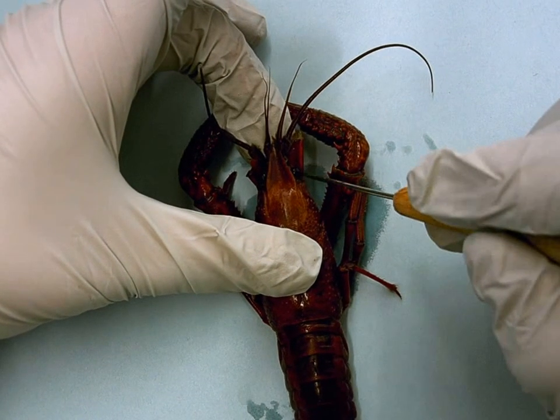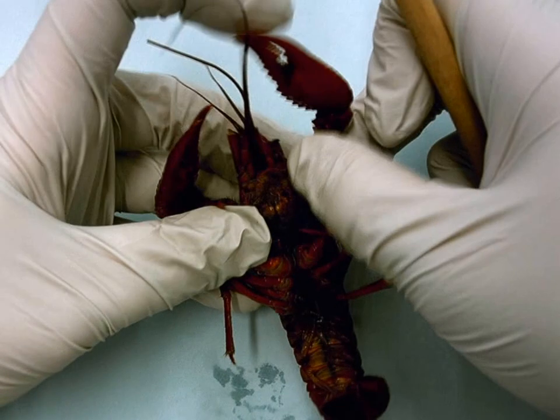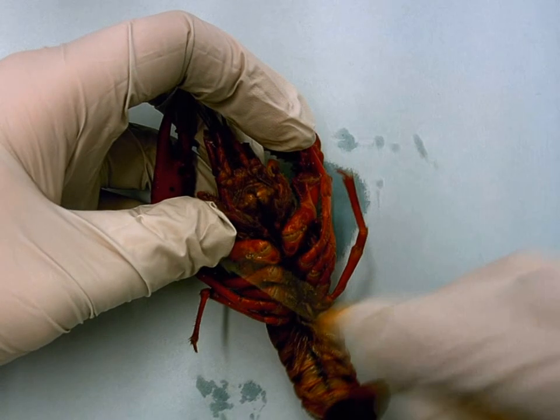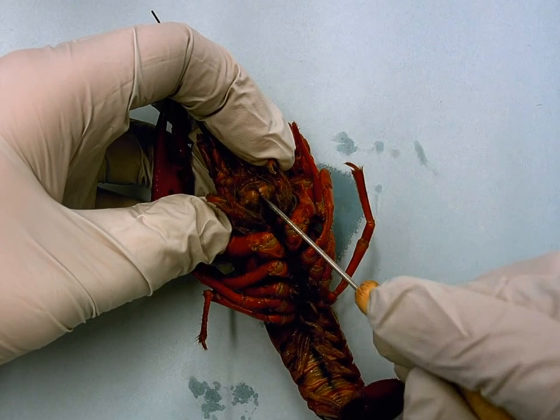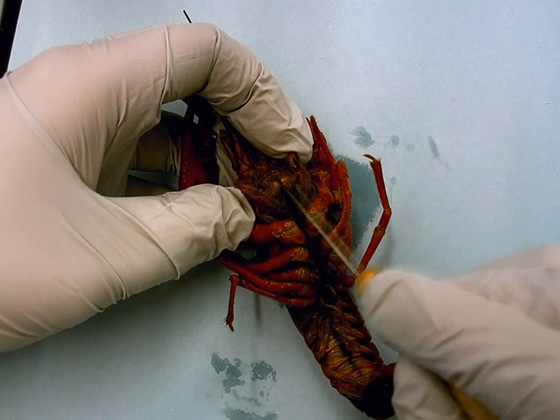Then you want to find the mandibles, which are for biting food in the head. You pretty much have to turn the animal over. On the bottom side, you should see these two sharp, tough structures that almost feel like teeth. You should be able to open them and pull them out to expose the mouth pathway behind them.